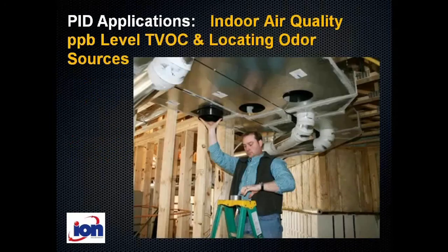Indoor air quality, by the new PIDs being able to measure at the PPB level, you can measure if there's an odor. You can locate the source by walking around until you can pick it up by the PID. Sometimes it's nebulous with your nose where the odor is coming from, but the PID is able to pinpoint it a lot better. And also just general levels of VOCs in indoor air.